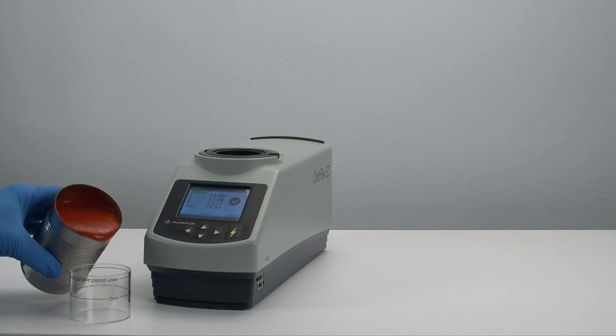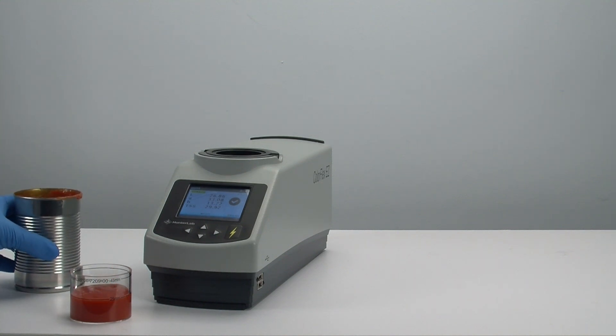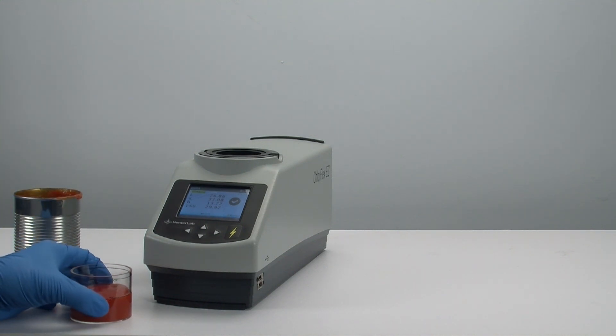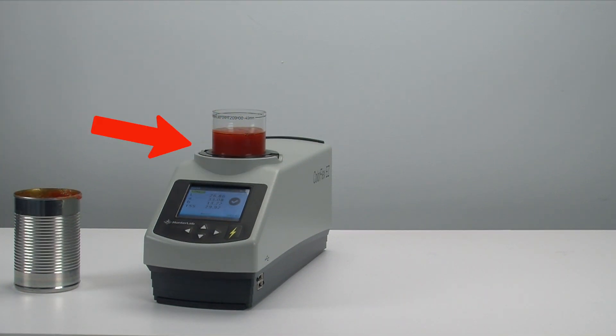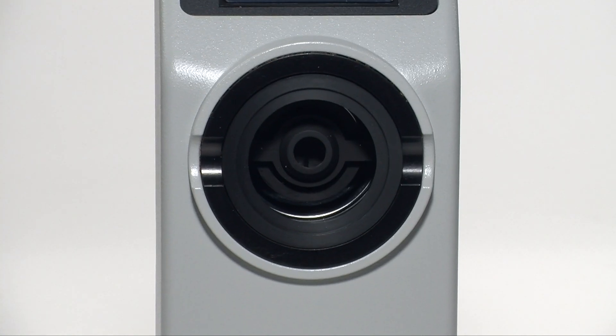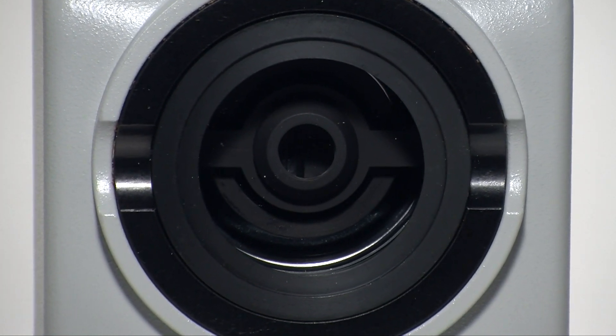First, put your sample into the sample cup. Place your sample cup onto the open sensor port where it clicks into place for stability. Notice this port is open with no visual obstruction to the full measurement area of the sample cup — only your sample is measured.